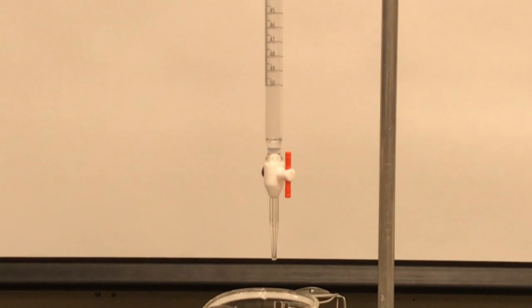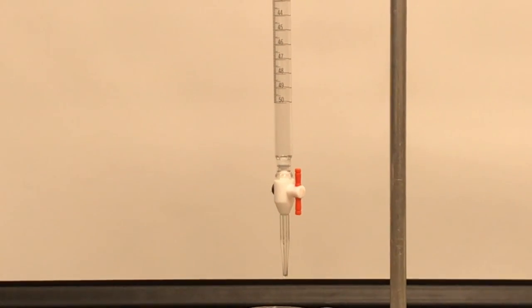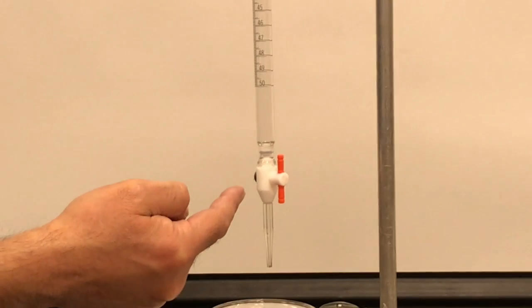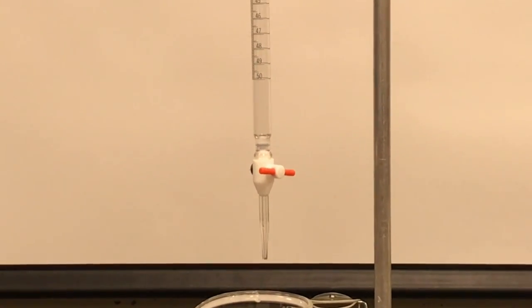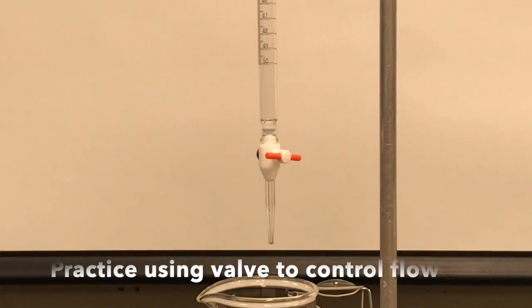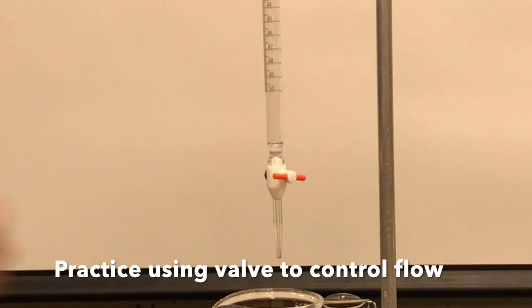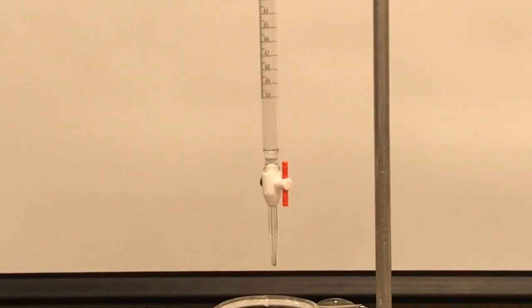To regulate the flow of liquid through the burette, we're going to use this valve here. It has handles. When the handles are vertical to the burette, the valve is open. When the handles are horizontal to the burette, the valve is closed. We're going to be rinsing with water, but this is a good opportunity for you to get used to using this valve to regulate the flow of liquid.